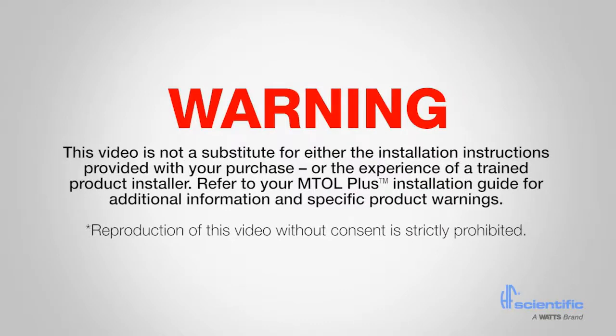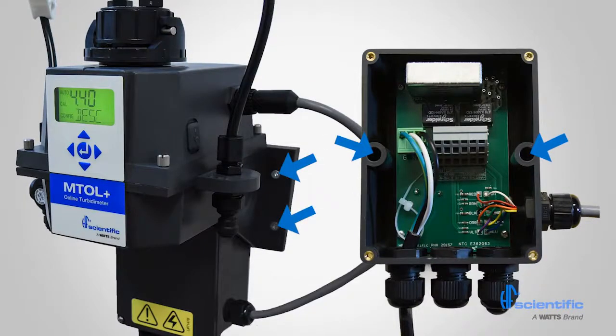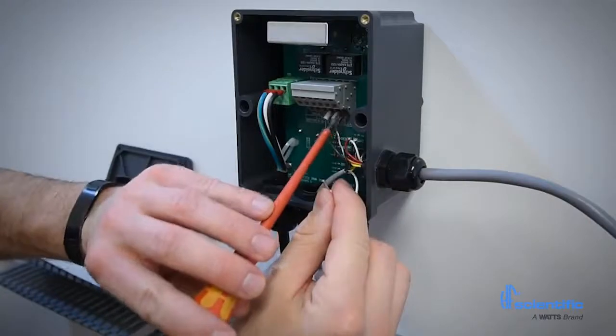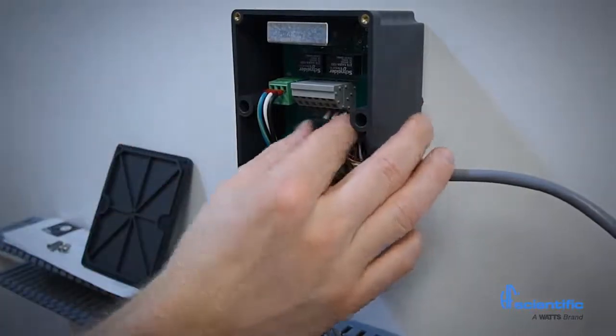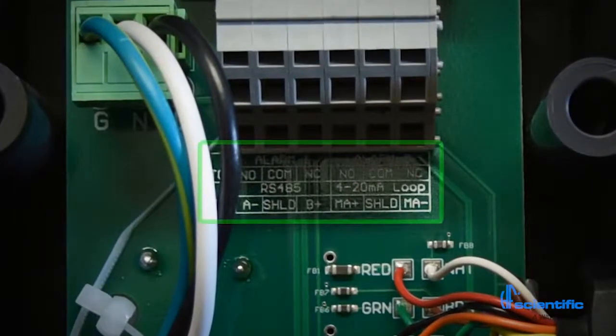This video does not replace the installation instructions. The instrument is mounted using 4 bolts for the sensor and 2 for the junction box. Plumbing connections are made using common 1/4 inch outside diameter tubing. All electrical connections are made inside the junction box. AC power from 100 to 240V is standard for operation. 24V DC models are also available through special order. Outputs include fully isolated 4 to 20mA, Modbus RTU, and 2 independent C4M relays.